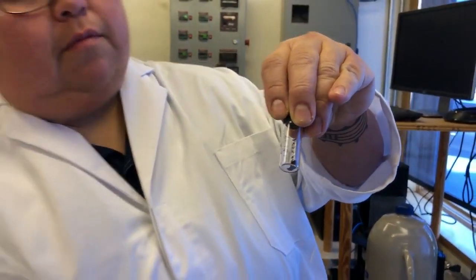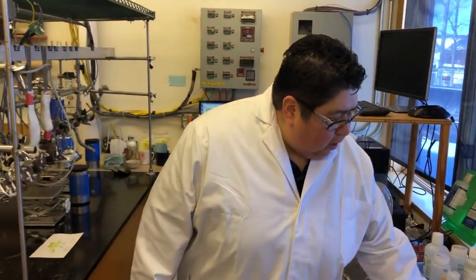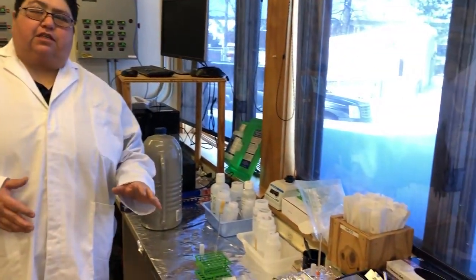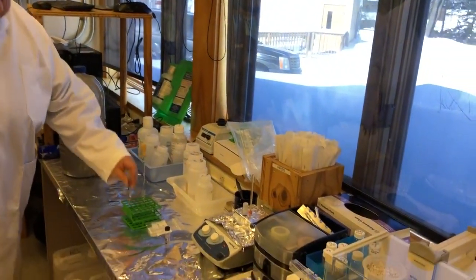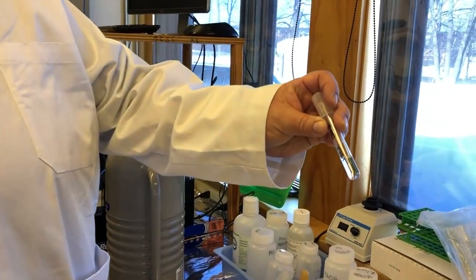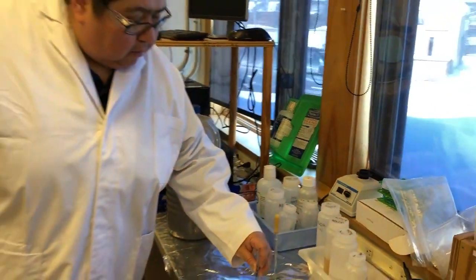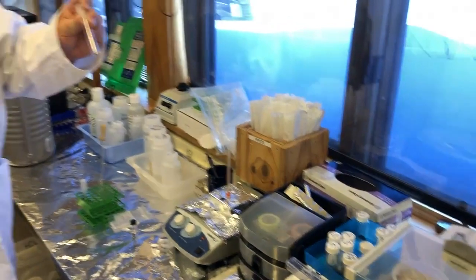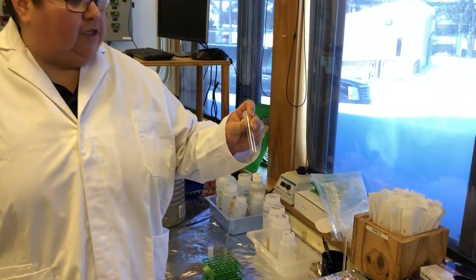So take it away. All right, so while that sample was sitting around waiting to be turned into graphite, it picked up a lot of modern carbon on its surface. So the first thing I need to do with samples is clean them up. And I do that by applying a series of acid and base washes on them. I've got a little sample here sitting in some acid as it's going through its treatment. Once I get it all cleaned up, I rinse it off, put it on a heat block, and dry it out. So that'll sit overnight and the sample will get nice and dry for me.